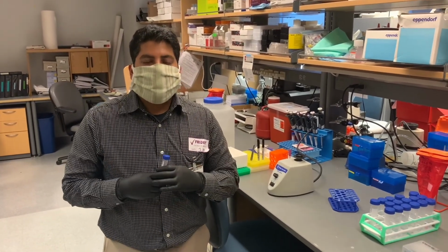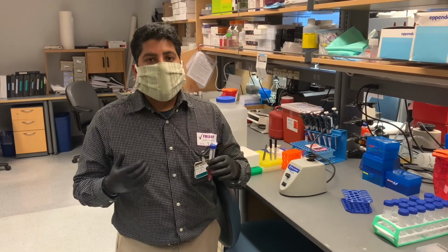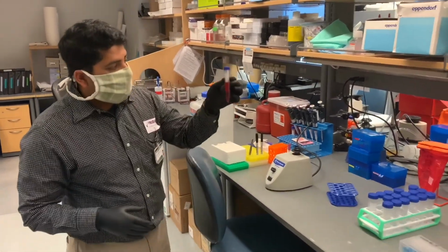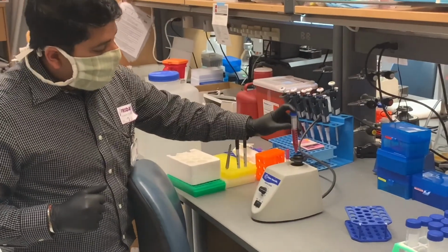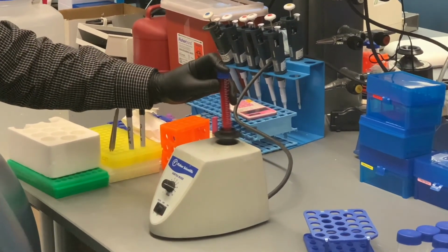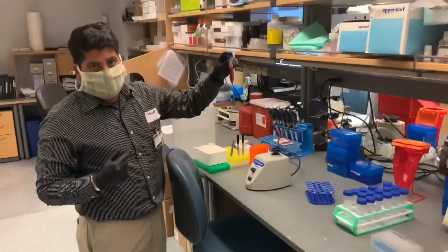Oftentimes, when we're setting up our reactions, we have to mix multiple liquids or products together and have to ensure that they're thoroughly and well mixed. The way that we do that is we use various mixers that we have in our laboratory. And this is one example of a mixer where once you push down, fluid will start to mix within a tube, leading to a uniform mixture.